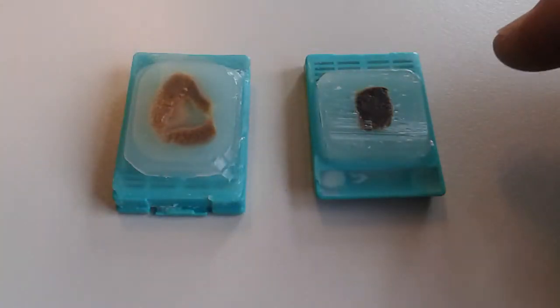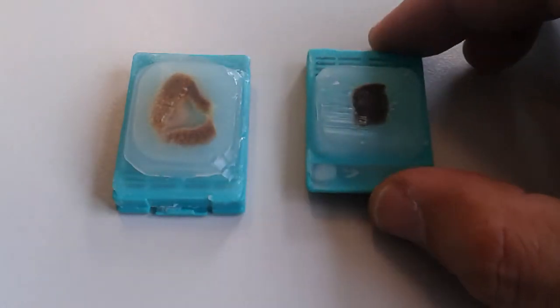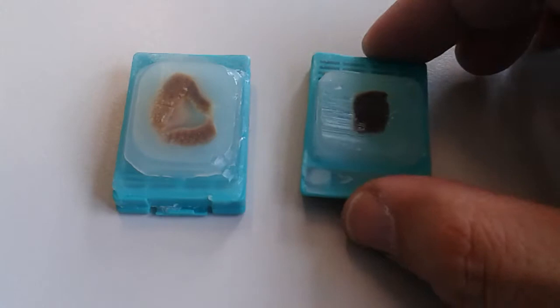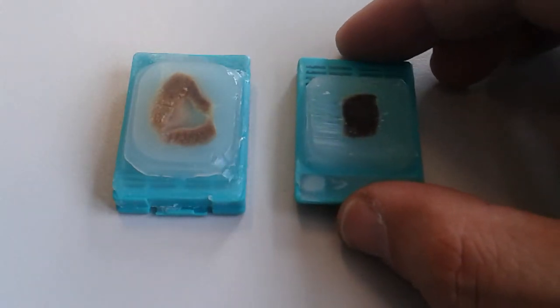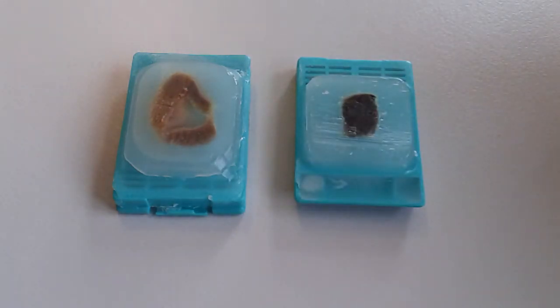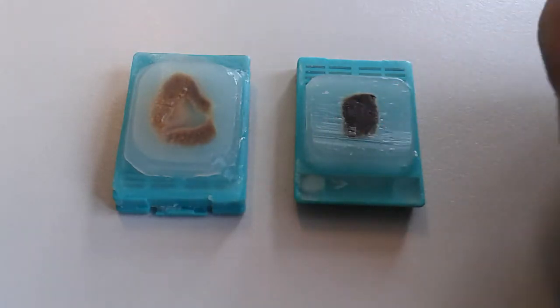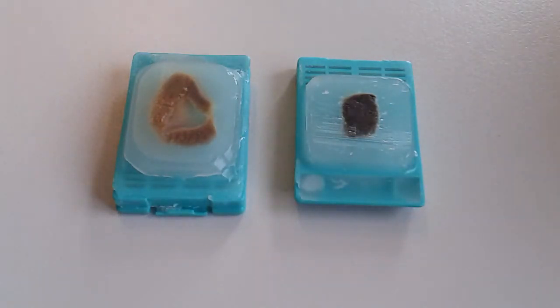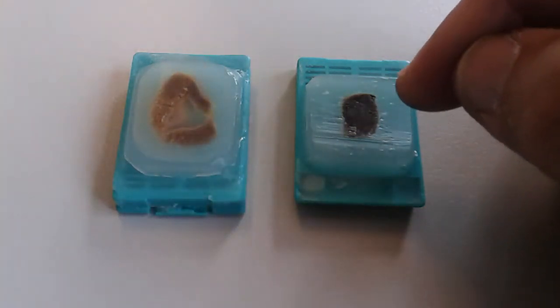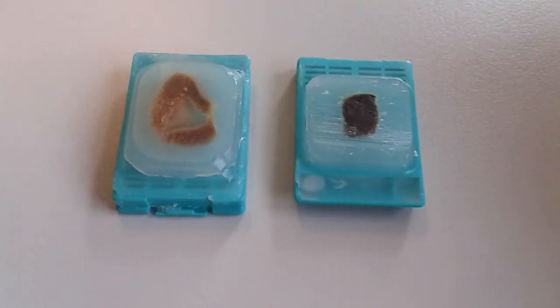Normally what you would do is put the specimen into paraffin, then melt it and bond it against the plastic tray like this. Then you would put the whole plastic tray into the microtome. One of the disadvantages of this system is that the specimen has to be completely dry and dehydrated, otherwise it is not possible to embed it into paraffin. Later on, you also have to remove the paraffin again in order to make a permanent mount. These types of microtomes are commonly used in histology when you have to prepare samples of body tissue, for example.